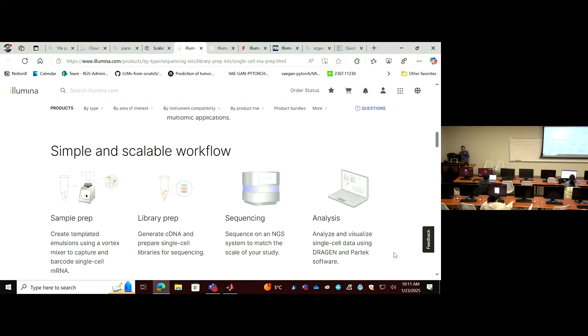So there's some advantage that 10x Genomics may have a very strong competitor right now on the market. But this doesn't create big news for some reason. I don't know why, but to me, if they can reduce the cost by 5 times and also reach the same quality, we have to test, and then that will be big news.